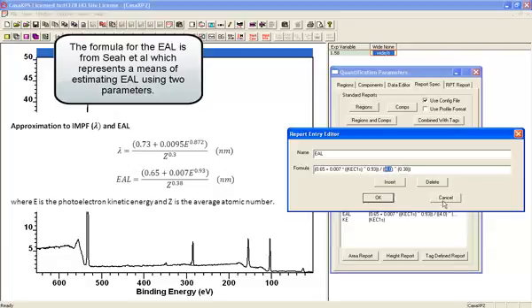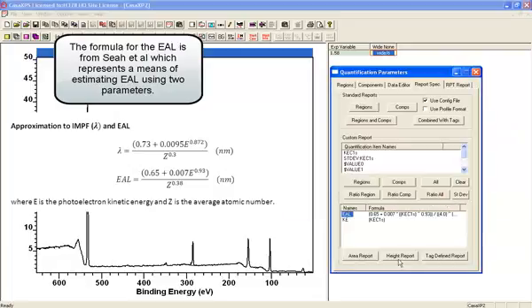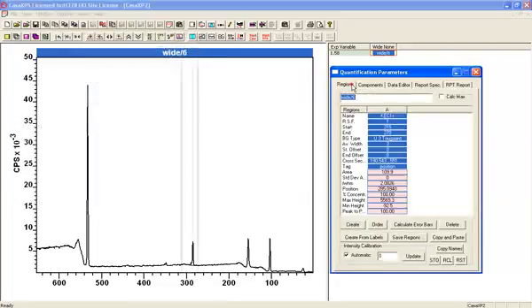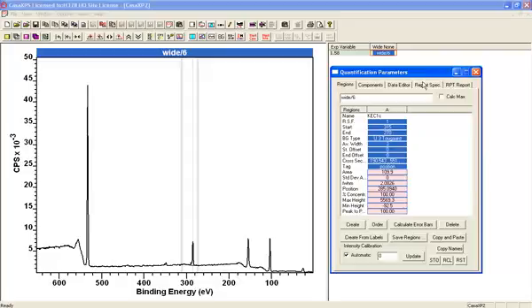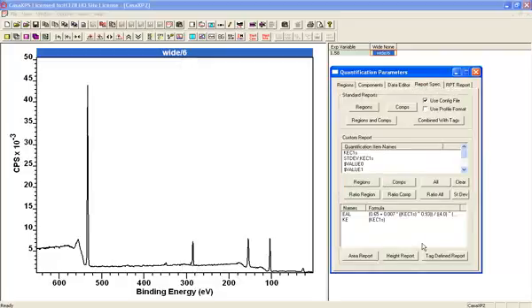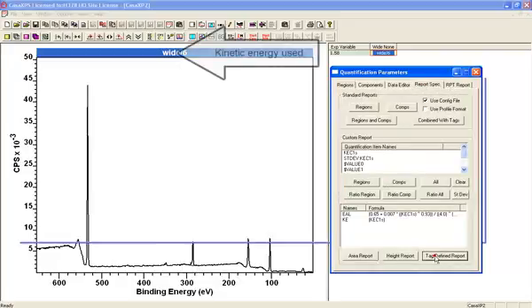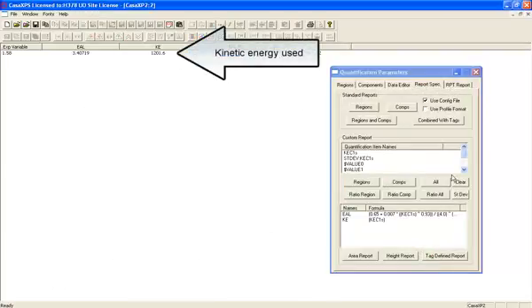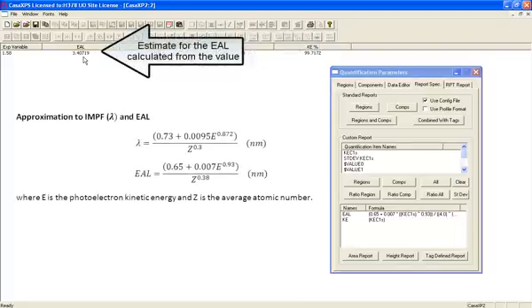Let's cancel that, and if I press the tag report — the fact that I've got this here position means the kinetic energy is coming in — go to the tag report. I can then calculate using this formula an effective attenuation length of 3.41.